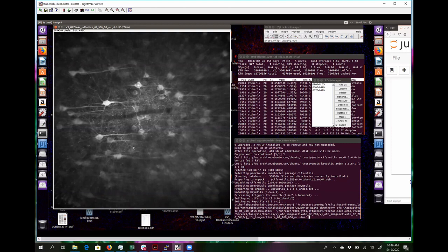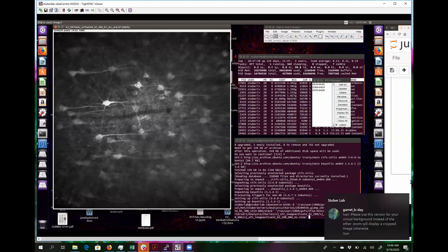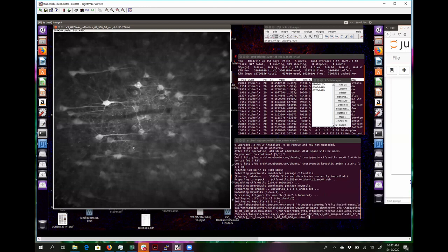Related to what we just talked about, if there's overlap between cells, it's going to spuriously affect that number. But it's not just that. Remember that in addition to this, you also have an issue of neuropil correction. Yeah. And that's a whole different topic.